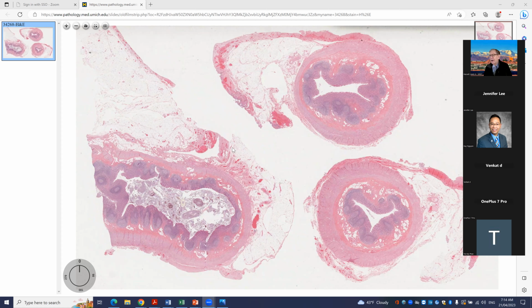And so I'm hoping that as we see some variations in the appendix, you'll enjoy both the pathology as well as the reminder that each specimen represents a patient, and even though it's a routine kind of specimen, it may hide a very interesting, or at least unusual finding that the patient deserves to know about.